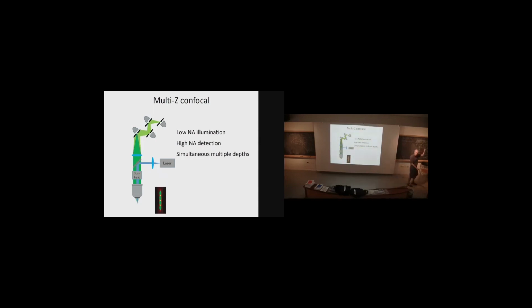So you can fill that excitation beam, and you can see all those probe volumes within that excitation beam at the same time. Basically, you're looking at all these planes simultaneously. What's nice is it's very light efficient. You haven't lost any light. Whatever light missed one pinhole eventually makes it into another. And you're collecting over a large range of angles, so you haven't lost any fluorescence light.